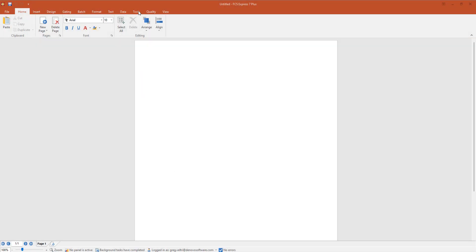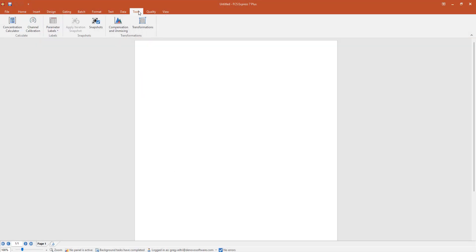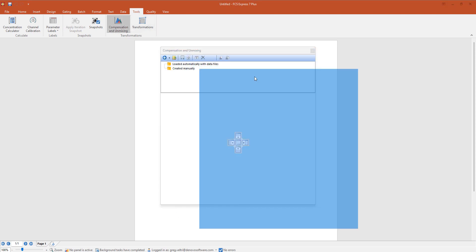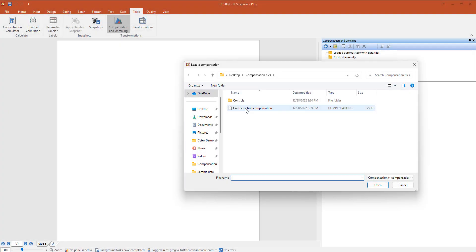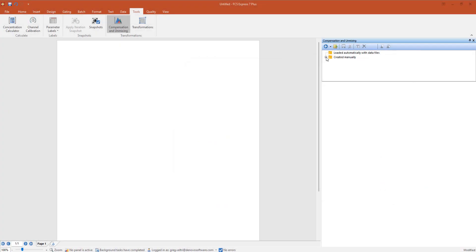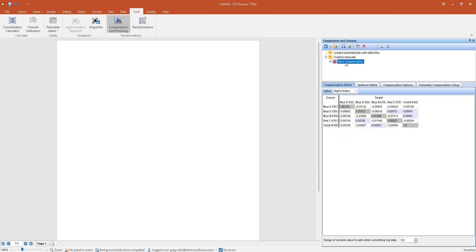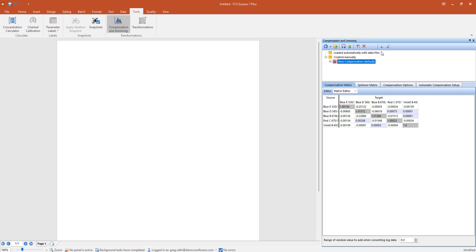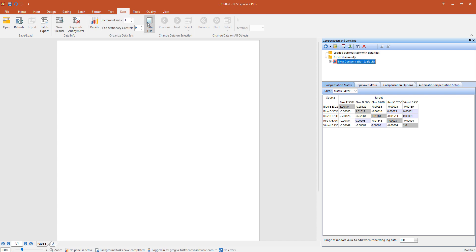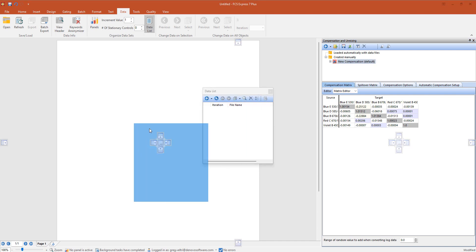In FCS Express, to apply the matrix to your samples, open Compensation and Unmixing in the Tools tab. You will load the saved compensation matrix by clicking on the folder icon, selecting the matrix you had saved previously, and click Open. You will right-click on the loaded compensation and choose Set as Default. Setting as Default will ensure that the saved compensation will be used, while also allowing you to access any compensations from the time of acquisition as needed.